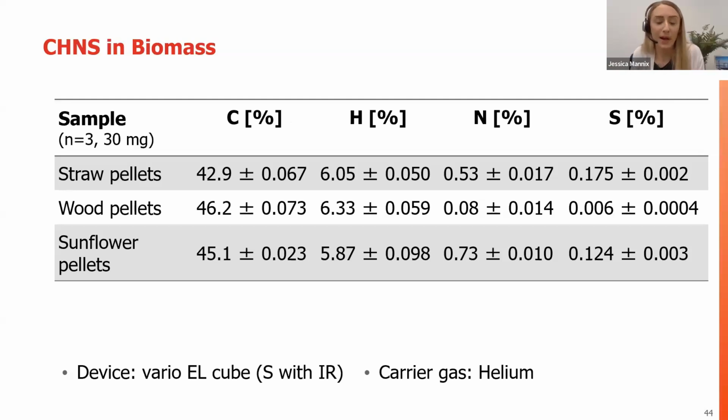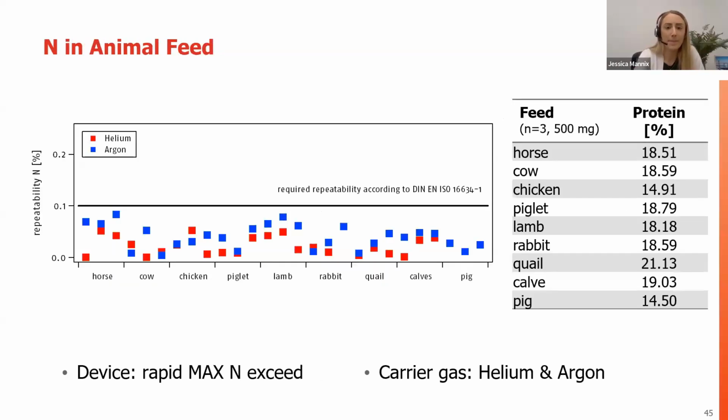Biomass and biochar have come to our attention in the coming years. I'm hoping that some of you are working in that field as well. I'll be happy to talk to you about it. A lot of the CHNS data has now kind of transitioned into a heavy focus on TOC data, but regardless, we run the samples on both instruments. I'm happy to talk about both.